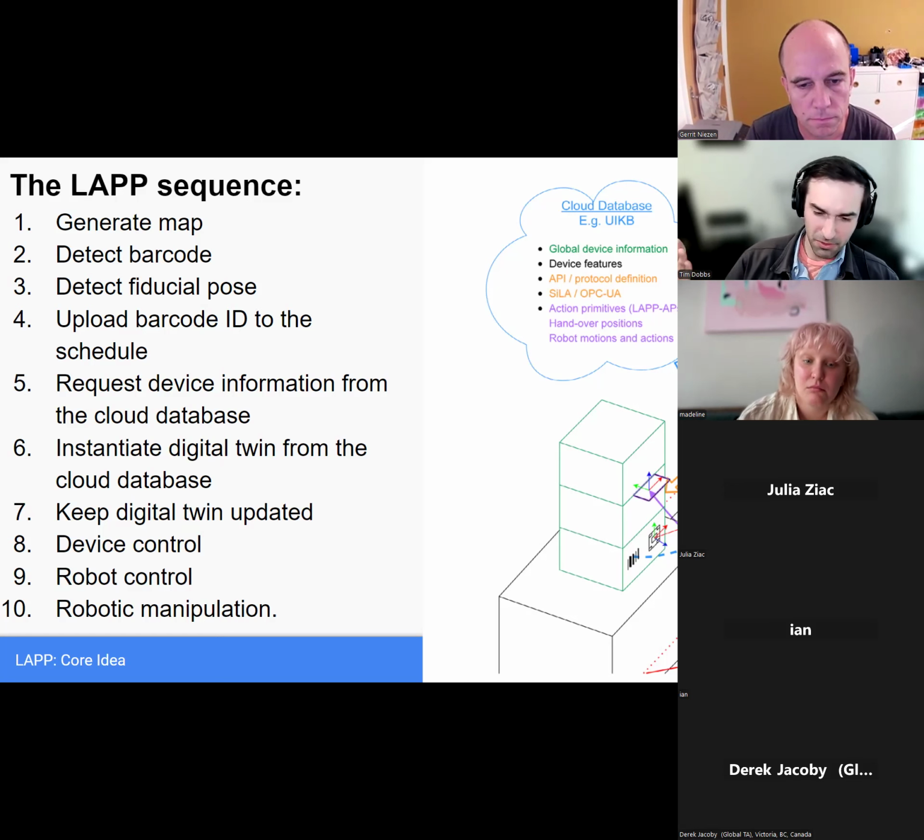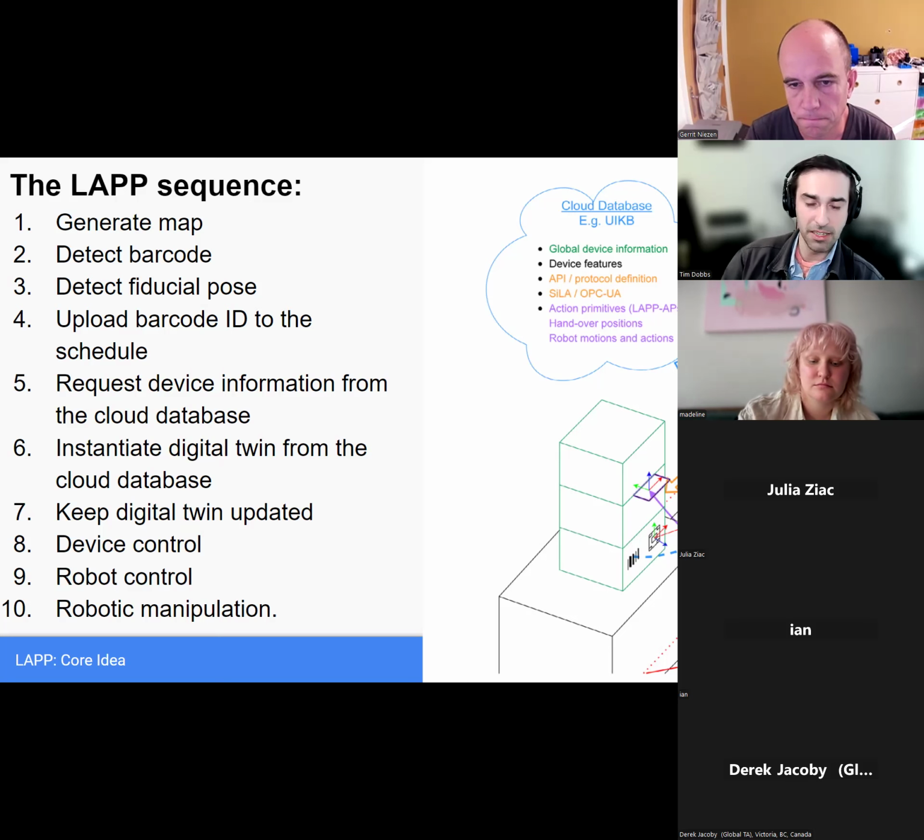It sounds like MES would be a term I would use, a manufacturing execution system. The idea here is this thing is keeping track of whether this device is available. Can I block off its time? So at this point, the robot's saying, cool, can I use this device? I'm ready to use it. If it is available, nice, I'm going to use it for the next hour for some protocol. And so the scheduler can keep track of all of that.